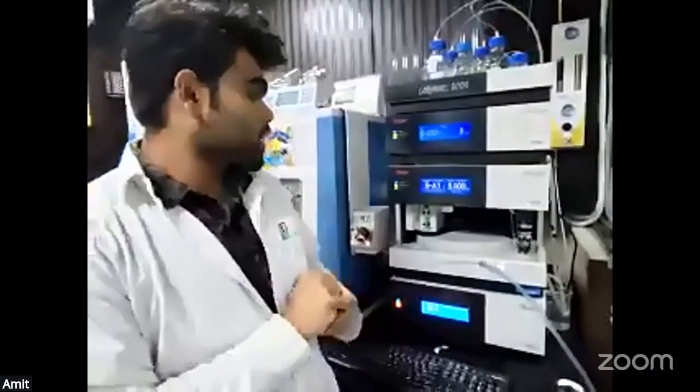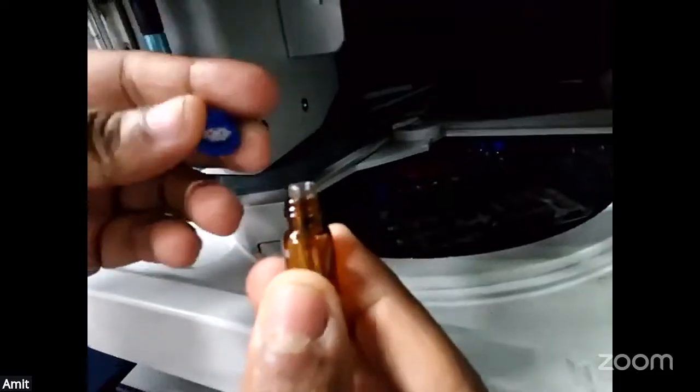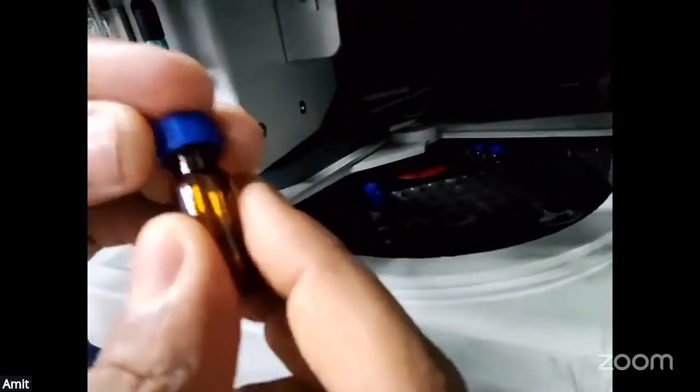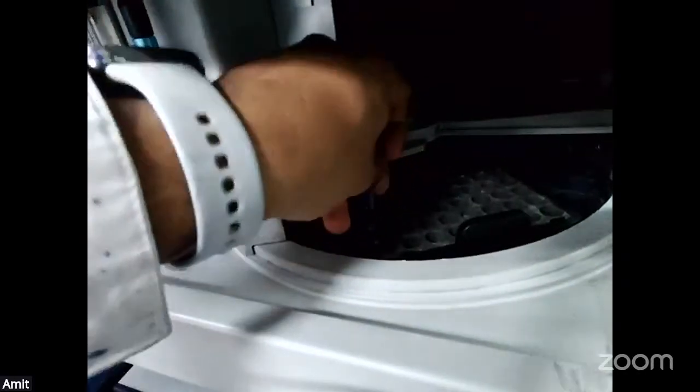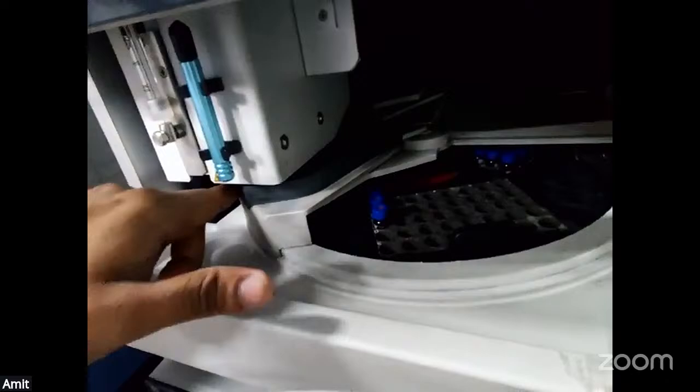Right now, here is the autosampler. In the autosampler, we put the samples in these small vials. You can see that in both metabolomics and lipidomics studies, we use these kinds of inserts. We put a low volume here, and we put this in the autosampler and run the samples.